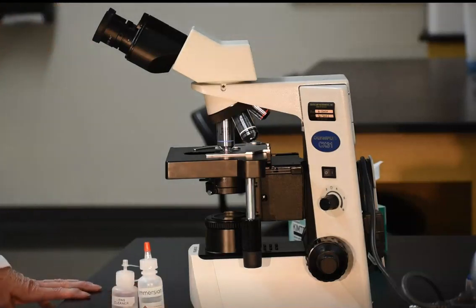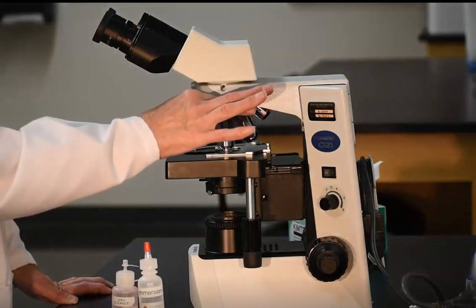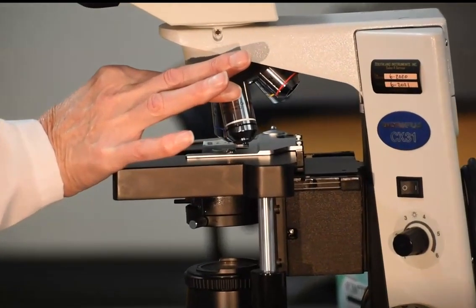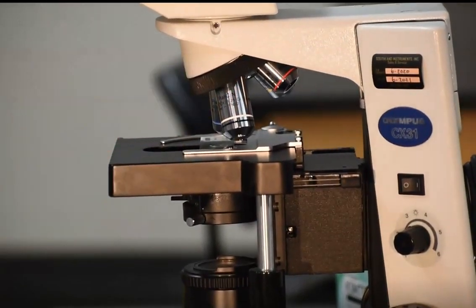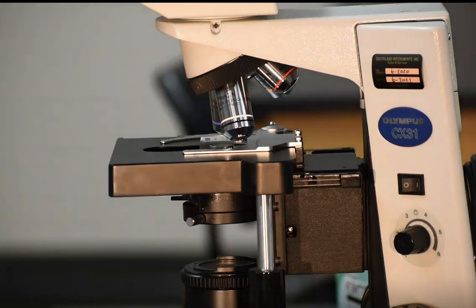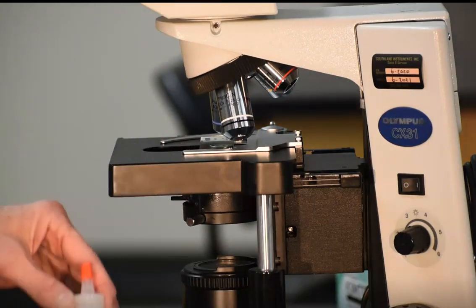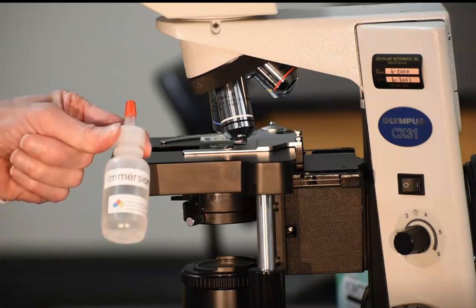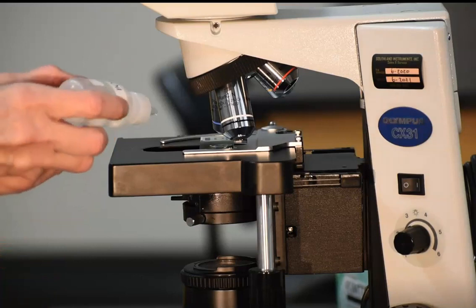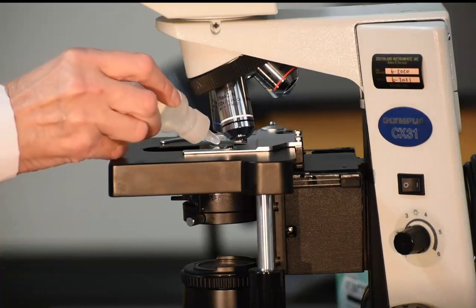When the specimen is clearly focused with the high-powered objective lens, you can proceed to the oil immersion lens. Rotate the nose piece into an intermediate position between the 40 and 100x objective. Place a small drop of immersion oil on the slide where the light is showing. Then rotate the nose piece to the left so that the oil immersion lens clicks into place.